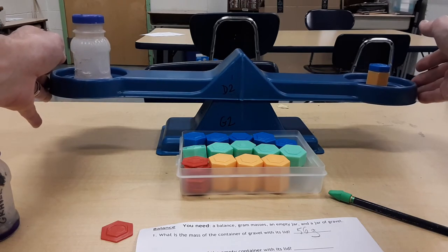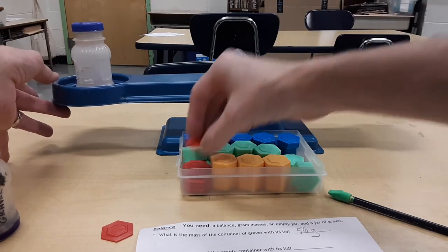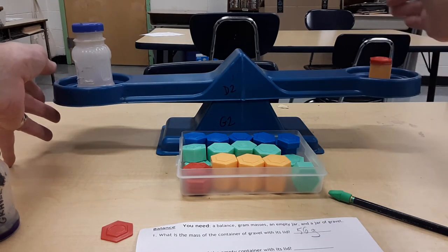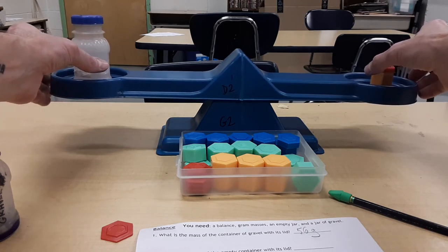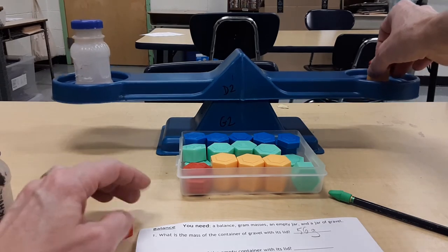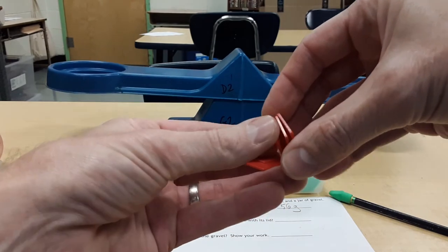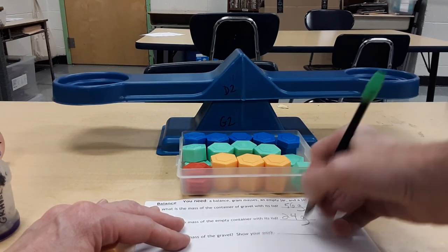And, almost. The 5 even looks like too much, so now I'm going to go to a red. 1, 2, 3, 4, and it's not exactly in the middle. And there it is, it's balanced. Okay, so the mass of the empty container, what is the mass of the empty container with its lid? Well, it equals 20 plus 1, 2, 3, 4. 20 plus 4 is 24. Don't forget to write the unit, grams.